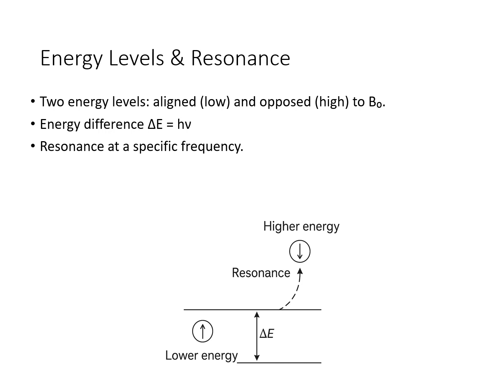This frequency is unique for each chemical environment, and that is why NMR is such a powerful structural tool. It means that each nucleus resonates at a specific frequency.